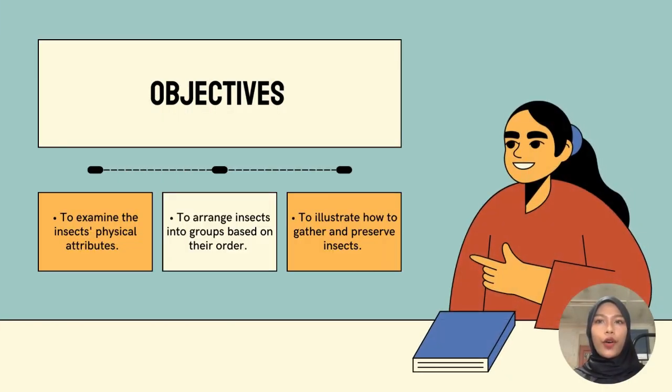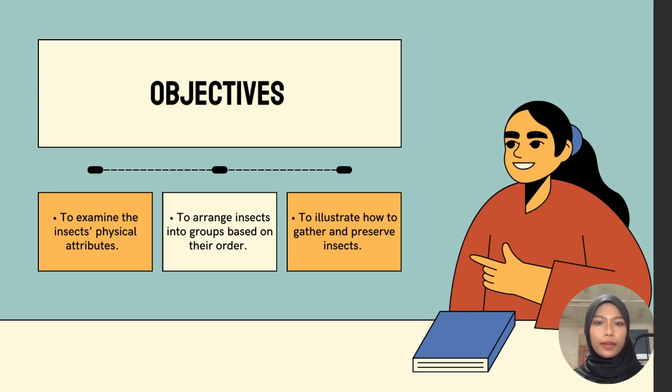The objective of this video is to examine the insect physical attributes, to arrange the insect into groups based on their order, and to illustrate how to gather and preserve insects.